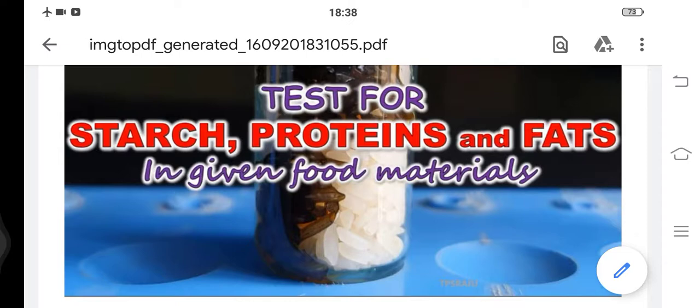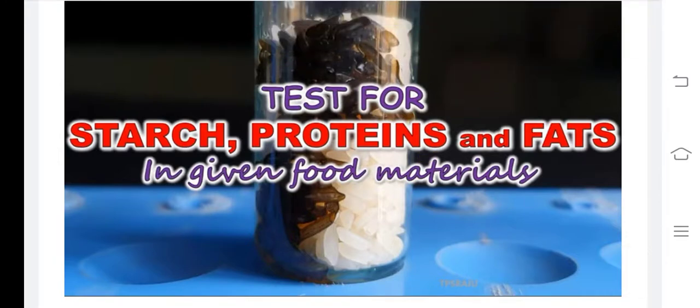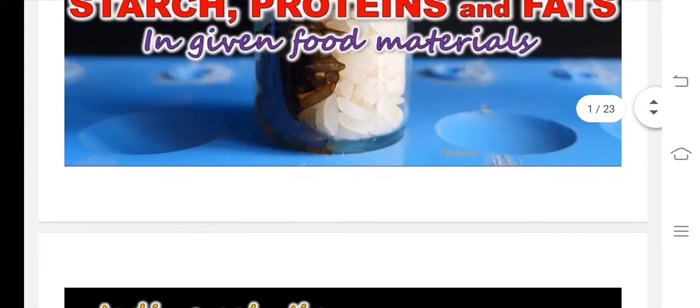Already you know that food is classified into three categories based on the function. One is energy giving food, body building food, protective food. Today what I am going to do? I am going to test the starch, proteins and fats. Let us understand test for starch.